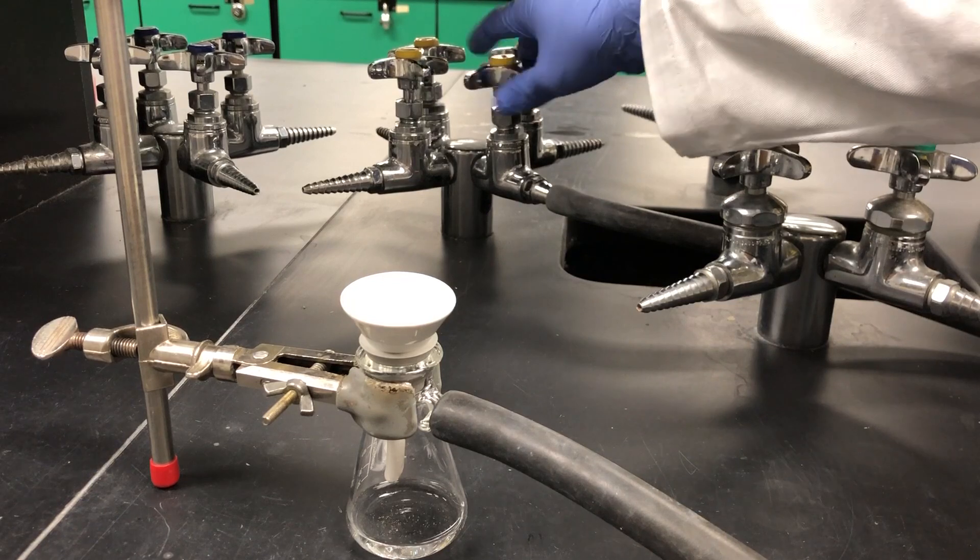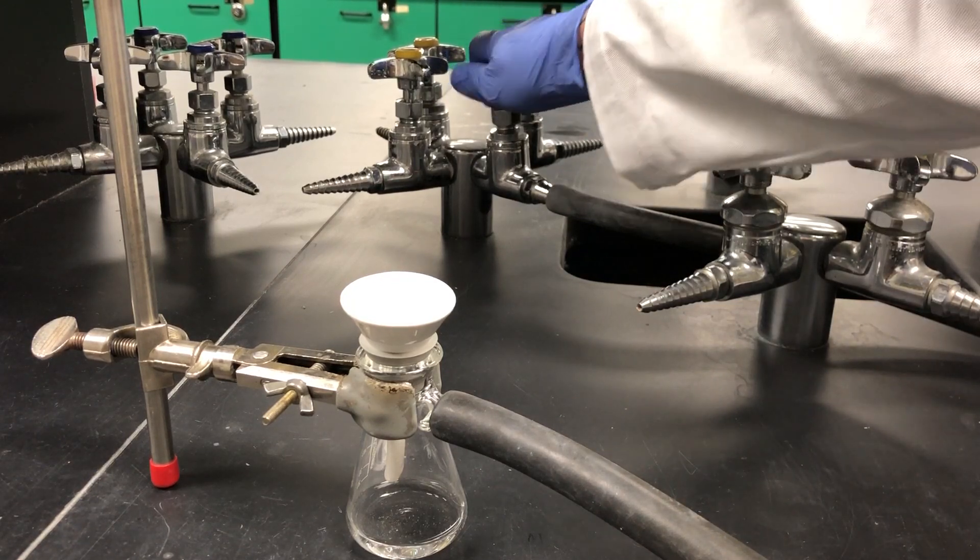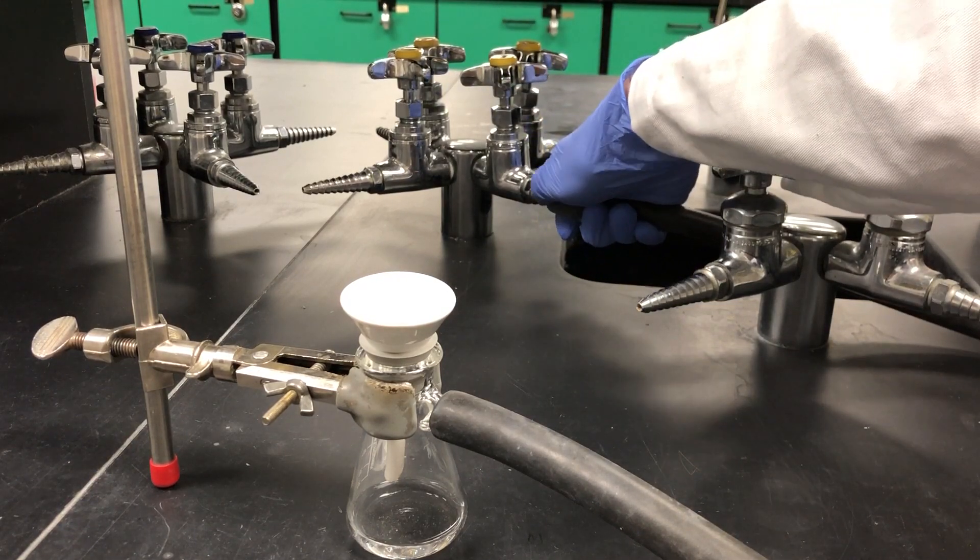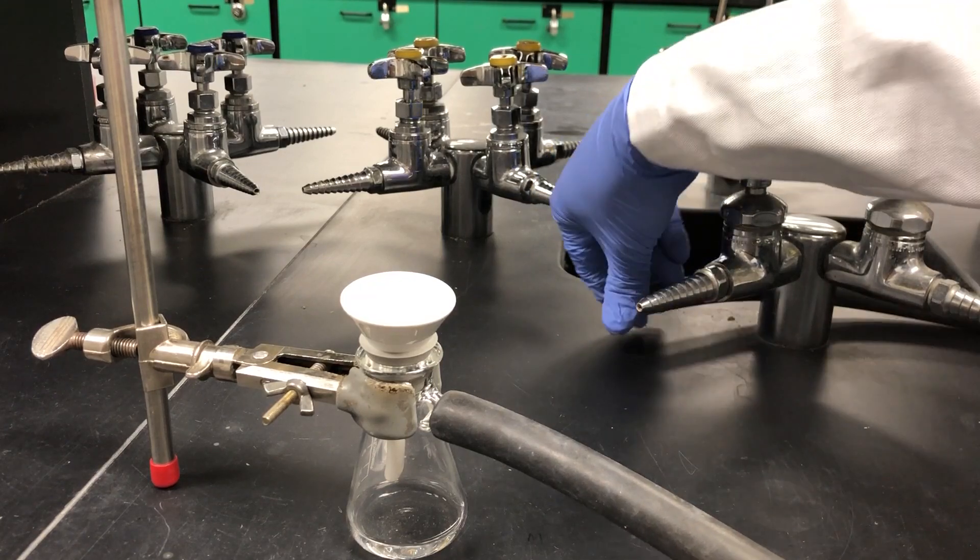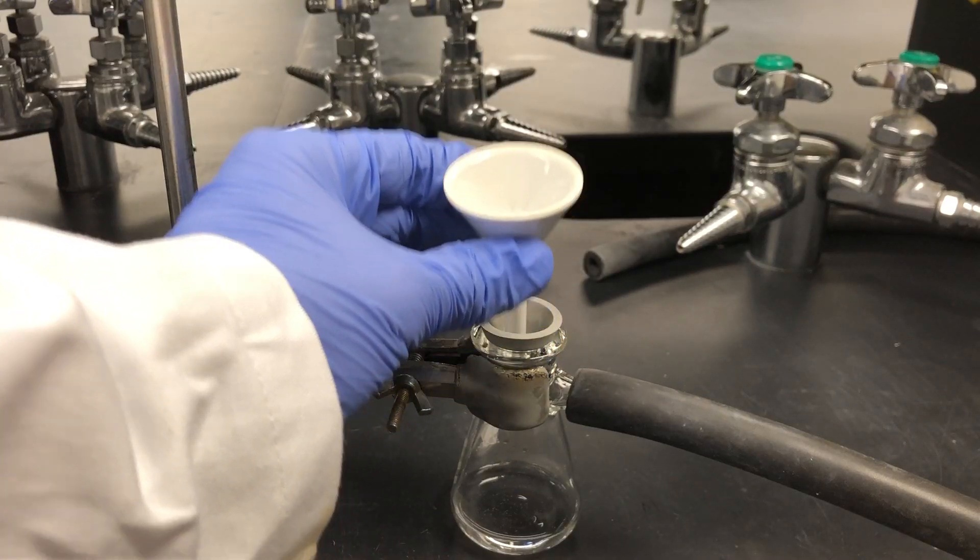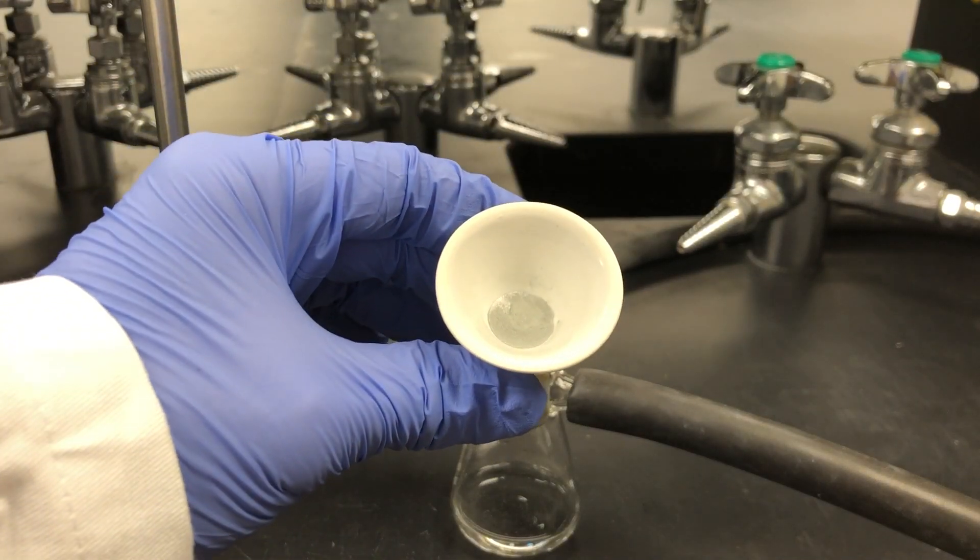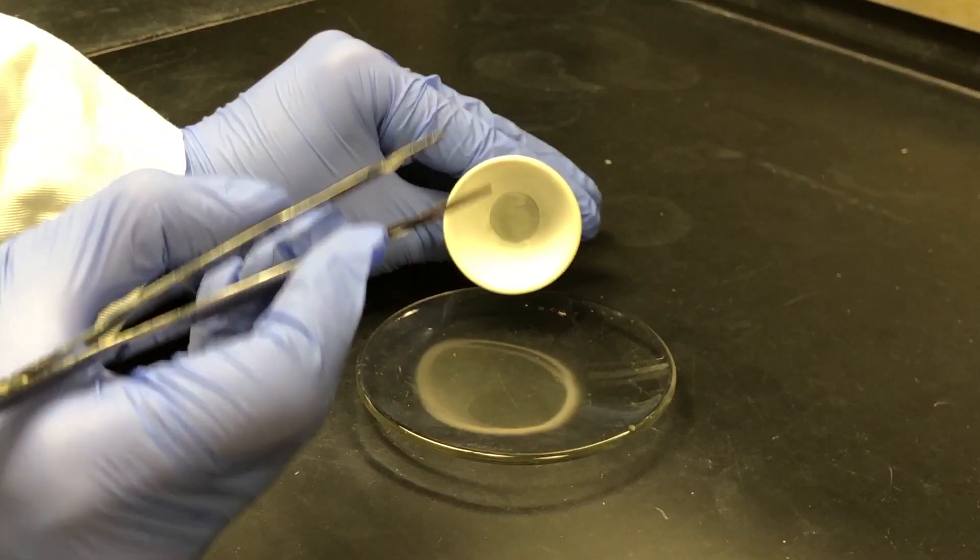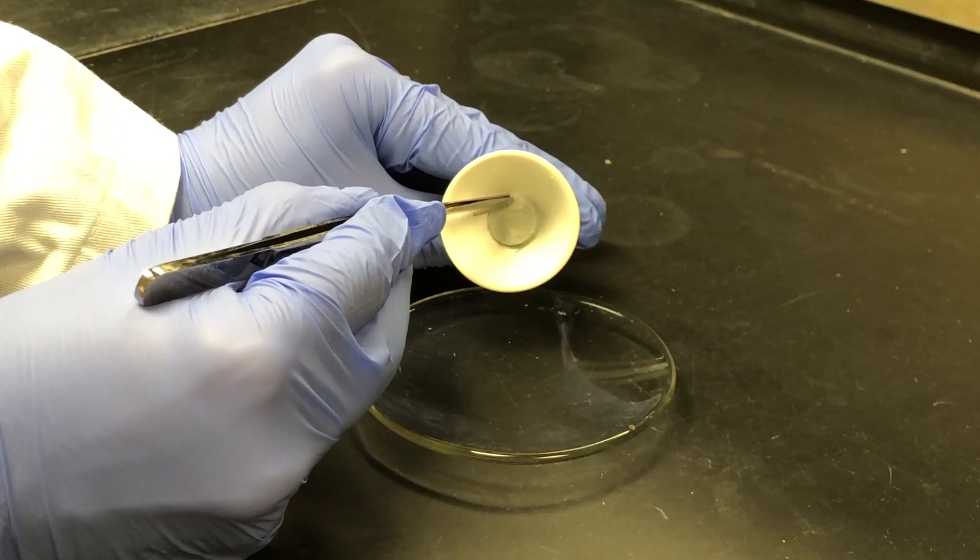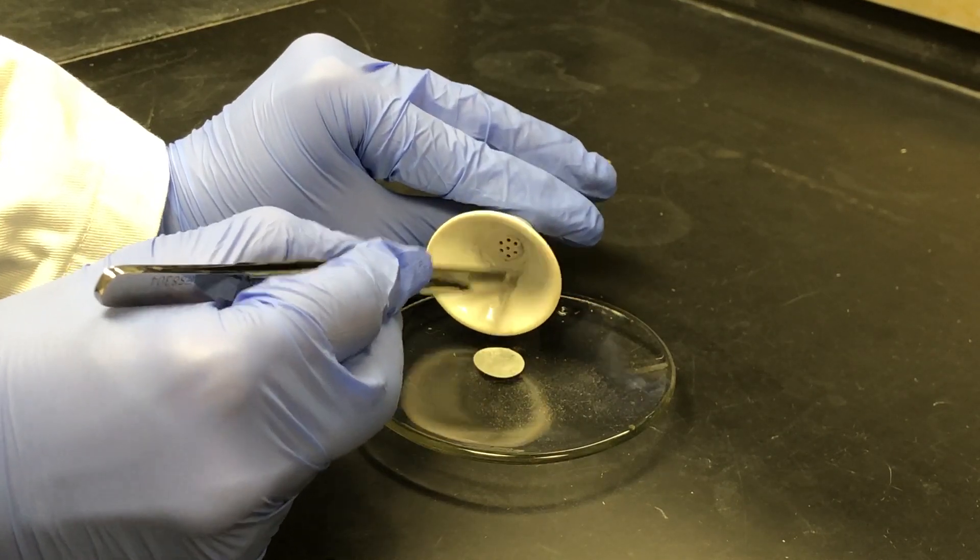Once your filtrate has completely drained into the filter flask, turn off the vacuum tap and remove the tubing from the tap. To remove your sample, take the Hirsch funnel off of the filter flask, and then use forceps to slide the filter paper onto a clean, dry watch glass.